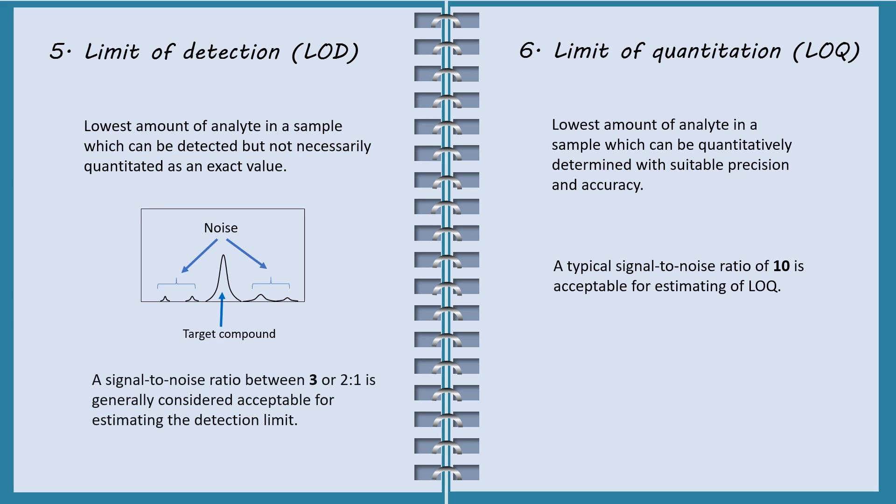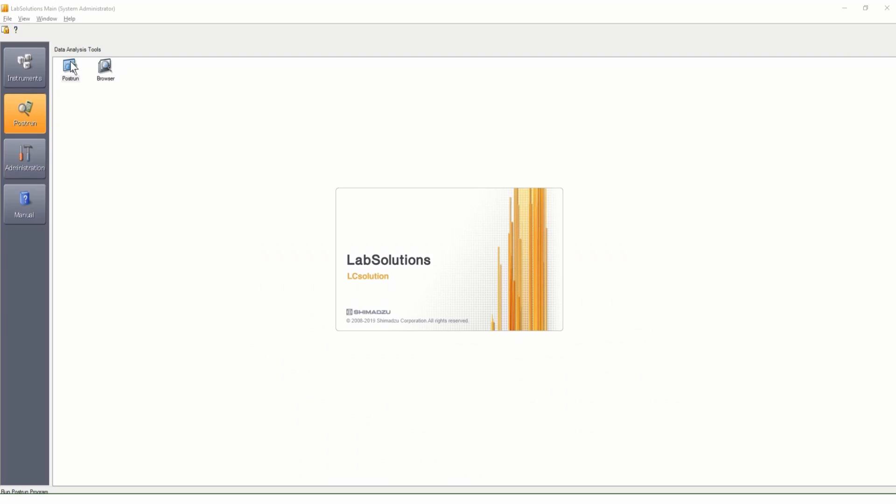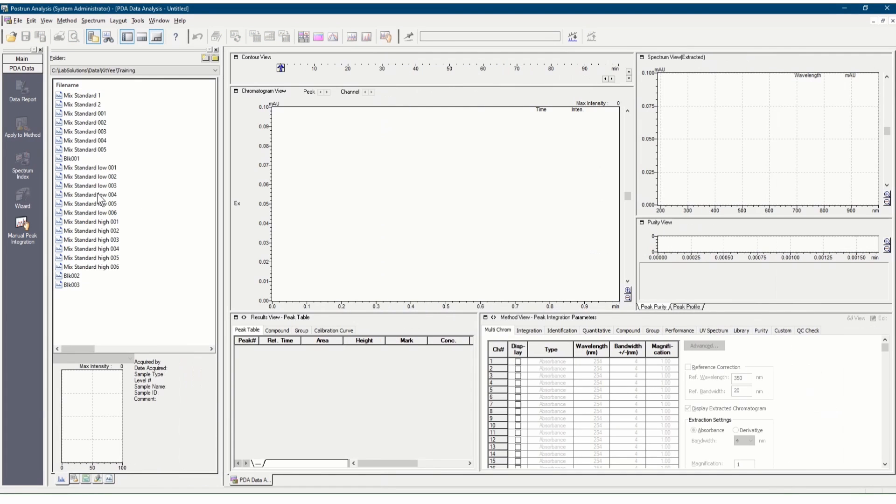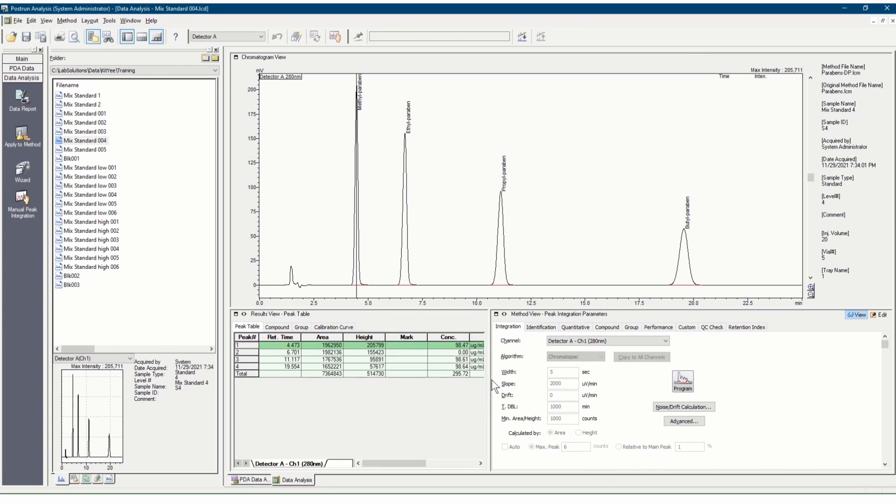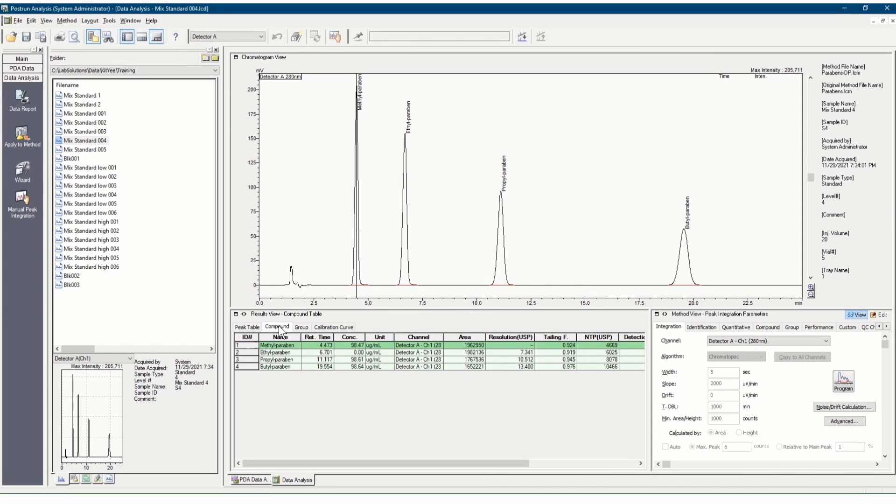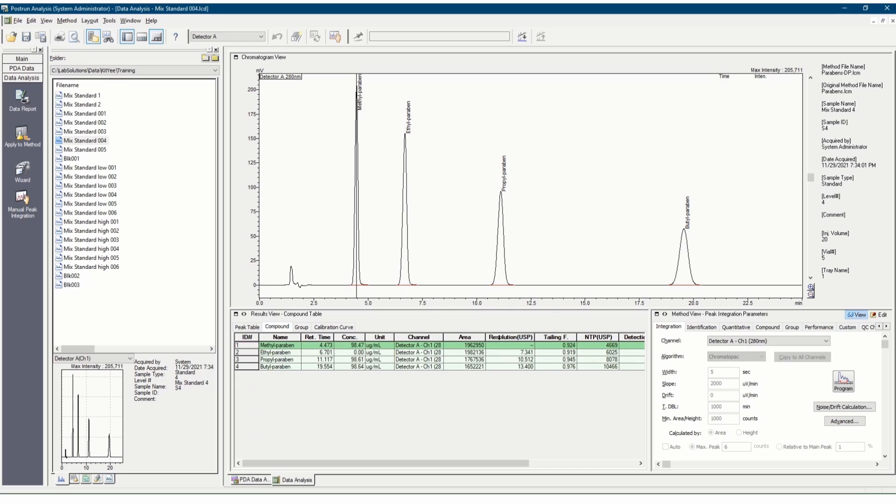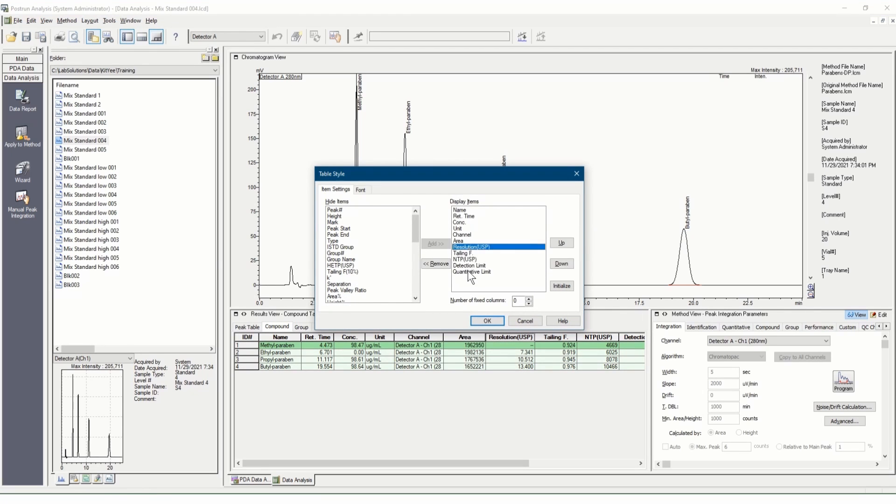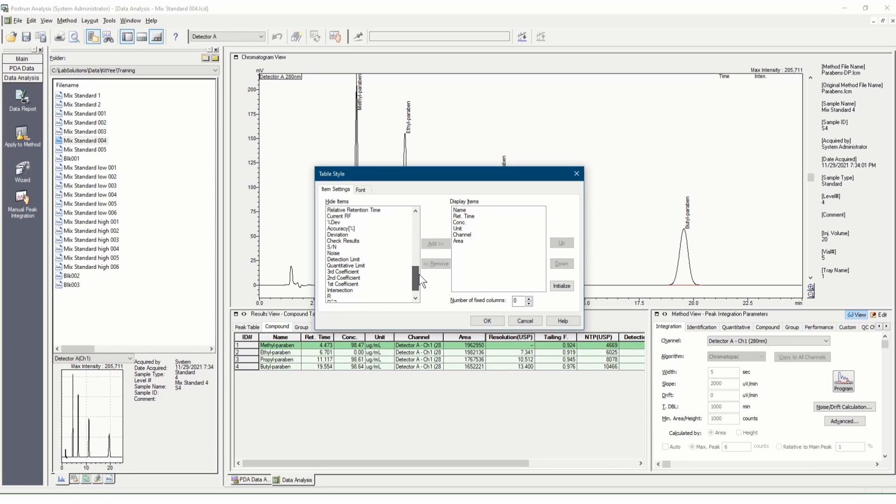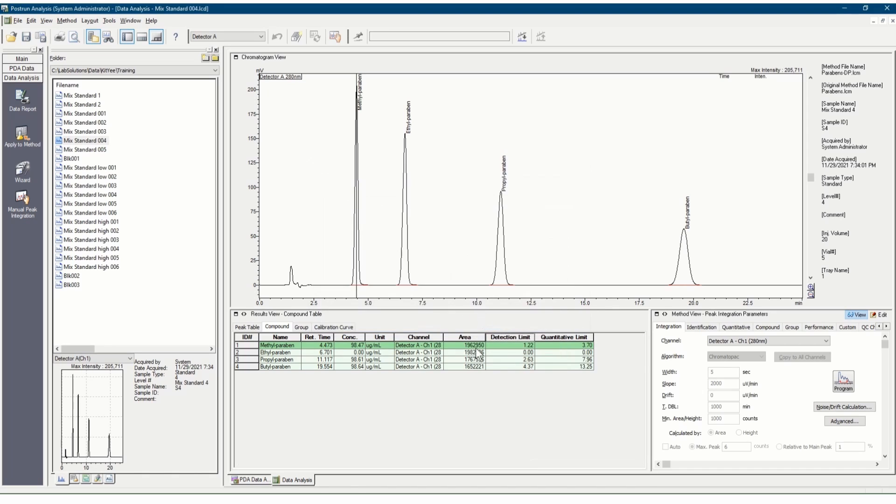Prior to determination of LOD and LOQ of a method in LabSolutions software, calibration standards must be run to obtain a calibration curve. Double-click post-run icon. Open any one of the standard files. At result view, in the data analysis window, click the compound tab. Right-click at any point within the table and select table style. Then, add detection limit and quantitation limit to display items. Detection limit and quantitation limit will be added as additional columns to the table.